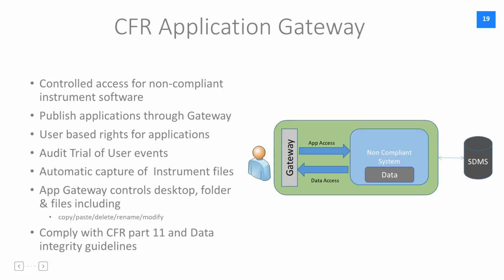CFR Gateway is a very unique solution provided by Agaram Tech. There are several instruments which do not have compliance related features in the instrument software. A simple example being user access controls, data access controls. None of these can be available in non-compliant systems.